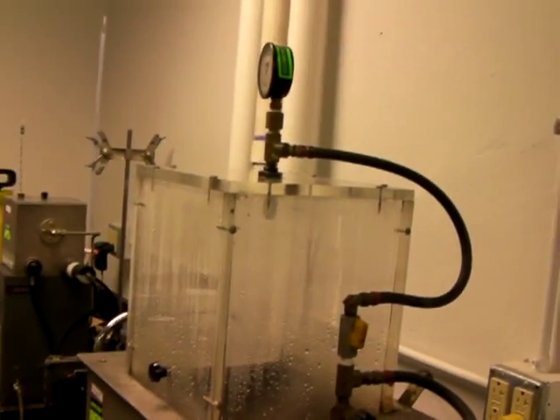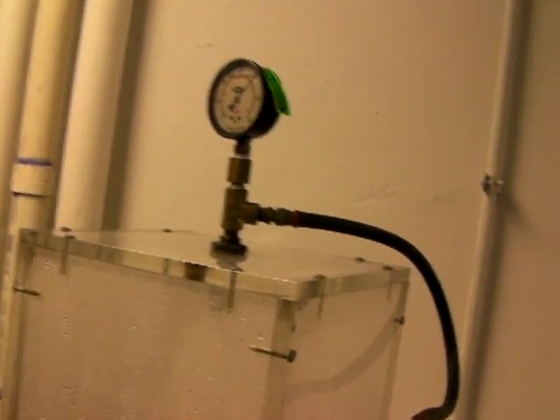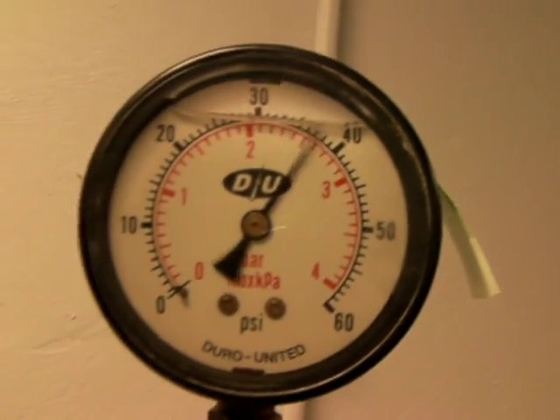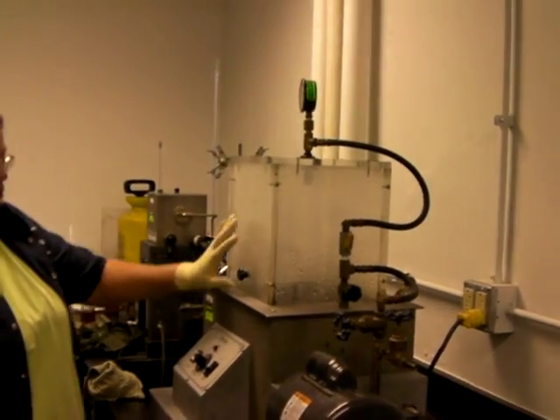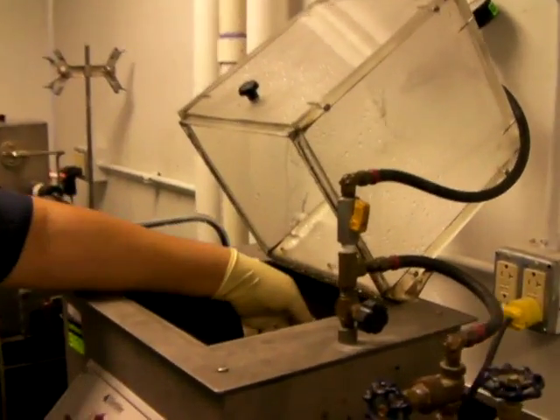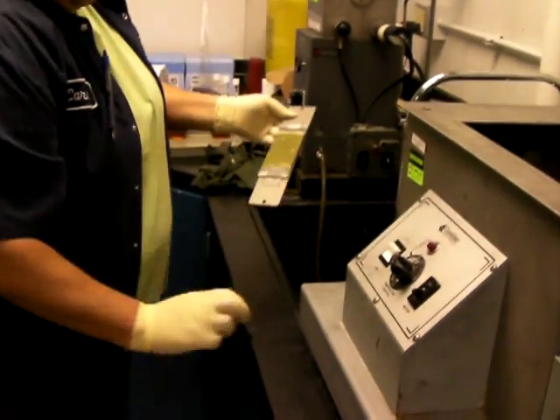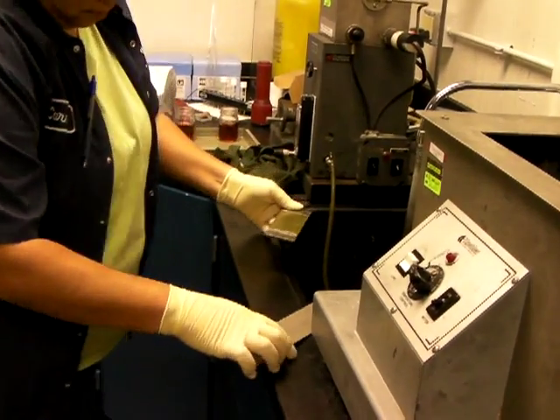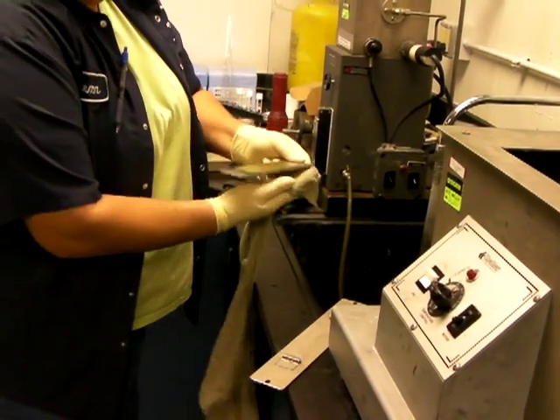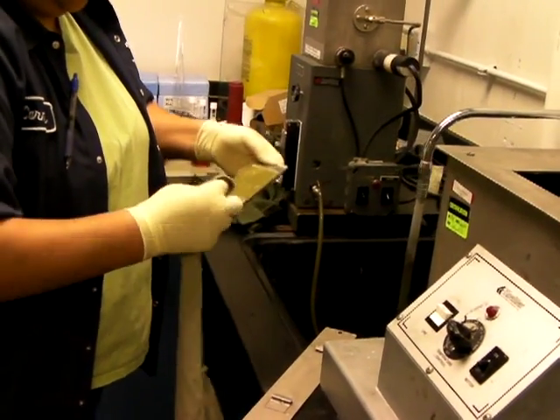The water is sprayed from above. I'm going to turn it on now. That's been running for five minutes now, and Carmen's going to take the plate out. Remove it from the special holder. Wipe off any excess water, being careful not to remove any grease.